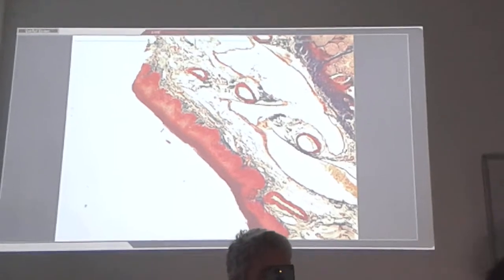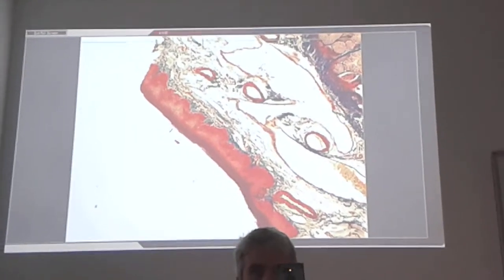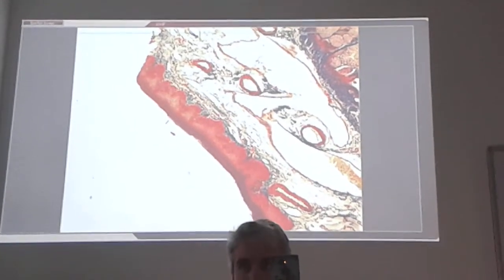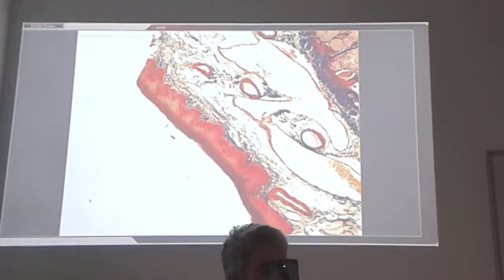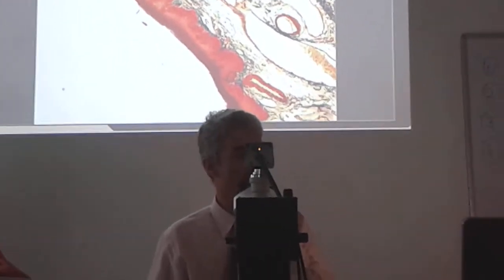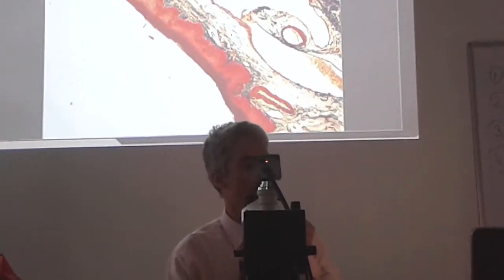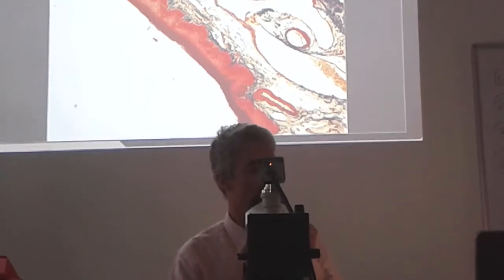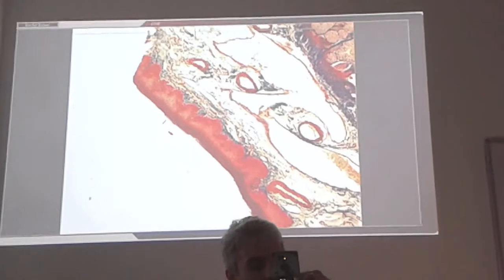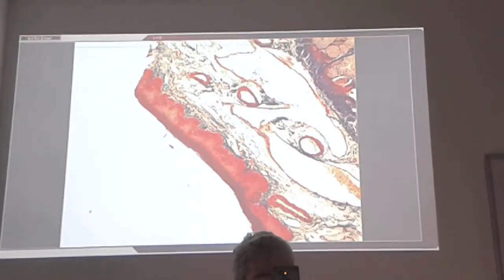So the first organ in our mouth, we will show you the tongue. The tongue in our mouth is the first organ, let's say, in the digestive system. And as you see, the tongue is very well identified.